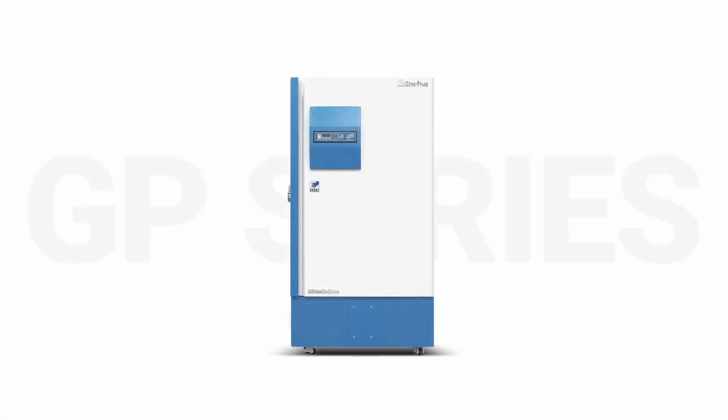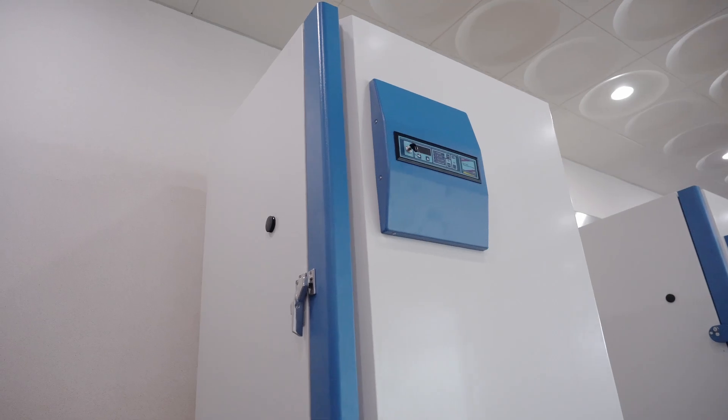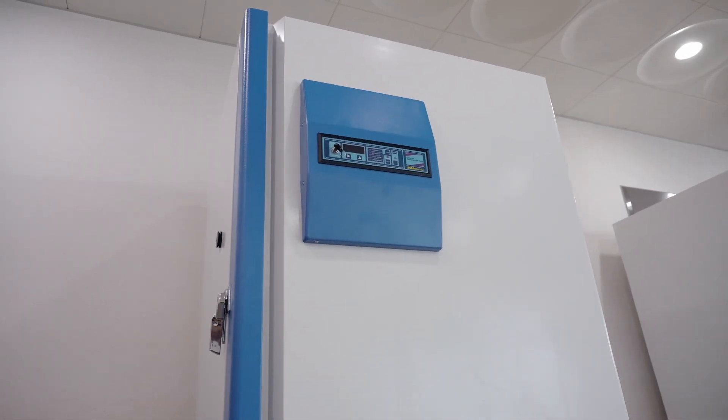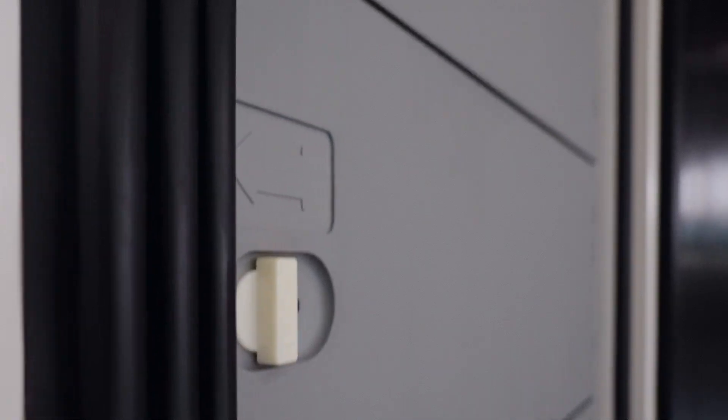GP-Series ULT Freezer of Irshin Biobase is designed with double safety compressor system as a simplified and economic solution for low temperature storage of your samples.